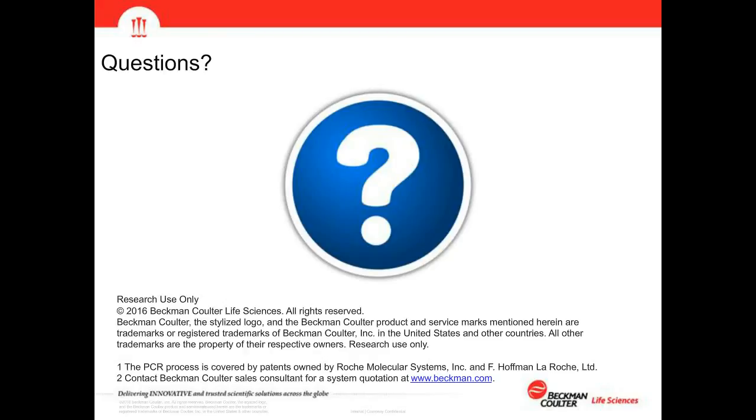And then just a quick point of clarification on the NimbleGen question from earlier. We have run the NimbleGen methods on our Biomek FXP platform, our largest platform, and those were developed in collaboration with specific customers. And as far as the question about how long it takes to do 12 samples or any number of samples, that really depends on the individual method being run on a specific instrument.